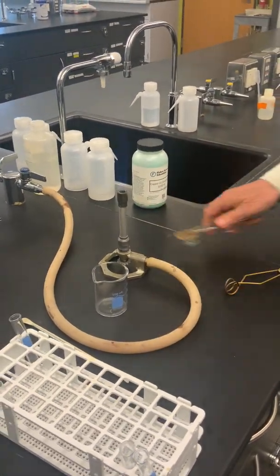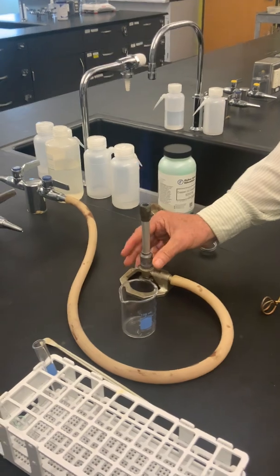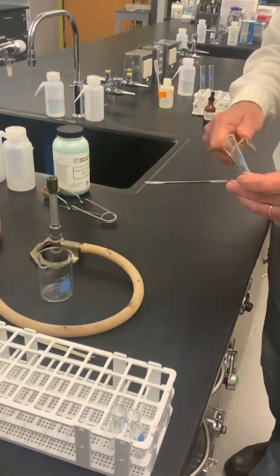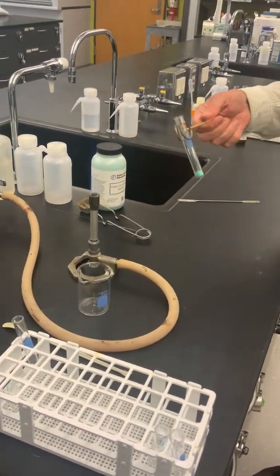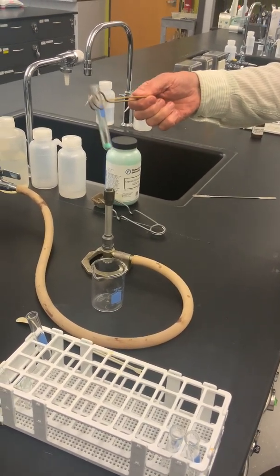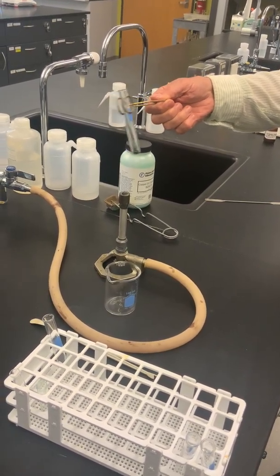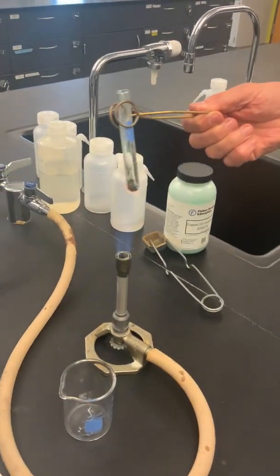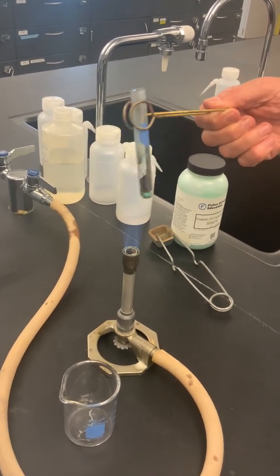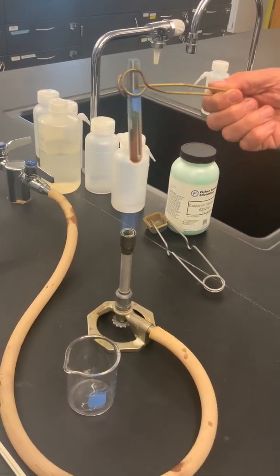Students really love that. Maybe you can see the flame, maybe you can't. It's a very, very pale blue. Adjust it a little bit. I use my test tube holder here, grabbing my test tube, and you're directed to simply put that copper 2 carbonate in the flame. I'm moving it around a little bit to encourage a little bit of mixing in there. We're watching then the transformation that occurs when the copper 2 carbonate is heated.